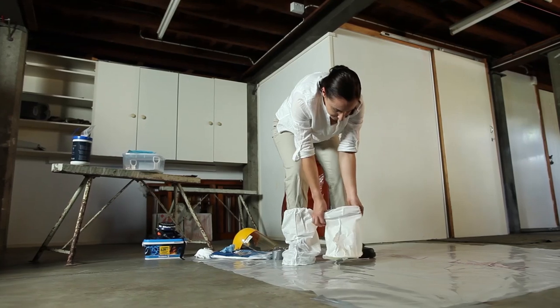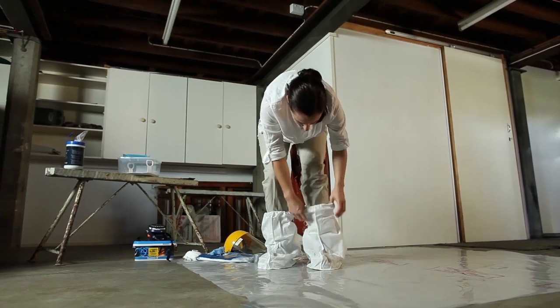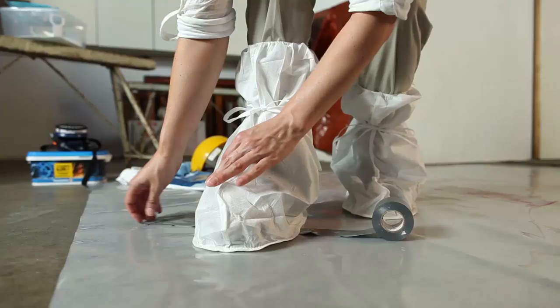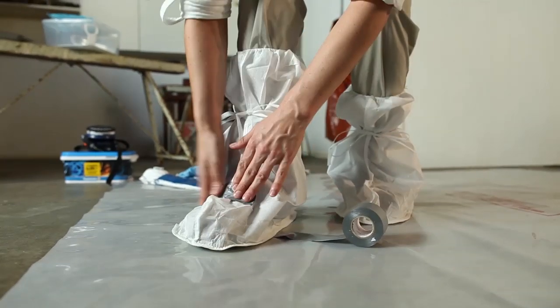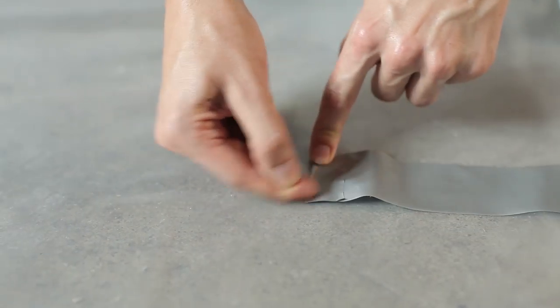When putting on disposable boot covers, the tough surface of the covers should be under the soles of your boots. The boot covers should be secured around your ankles using the ties, and then securely taped around your feet using duct tape. Shape a tab at the end of the duct tape to make it easier to remove later.